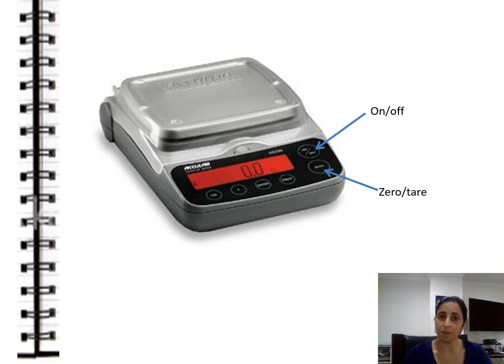The tare button is used for when, let's say, you want to weigh some powder inside of a container, and I just want to find the mass of my powder, but I can't just pour my powder on top of the platform on the balance. I first have to put my container on there, and then I can put my sample inside of my container.